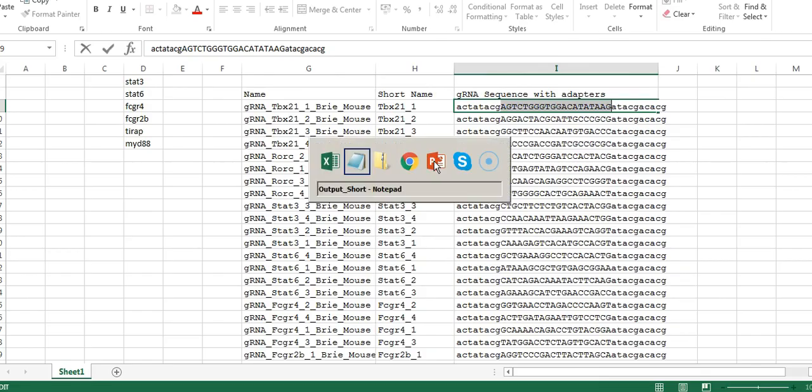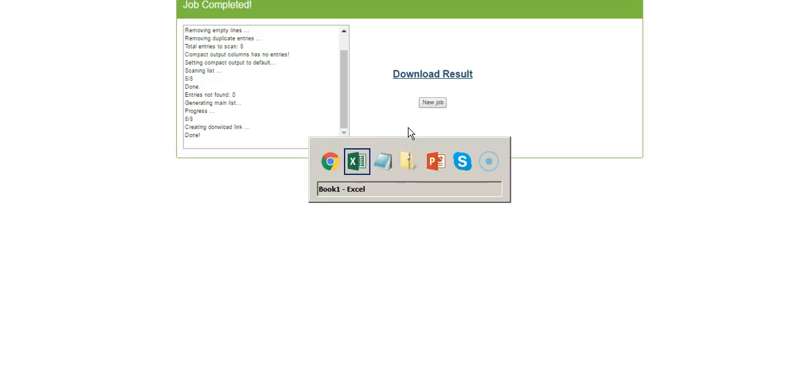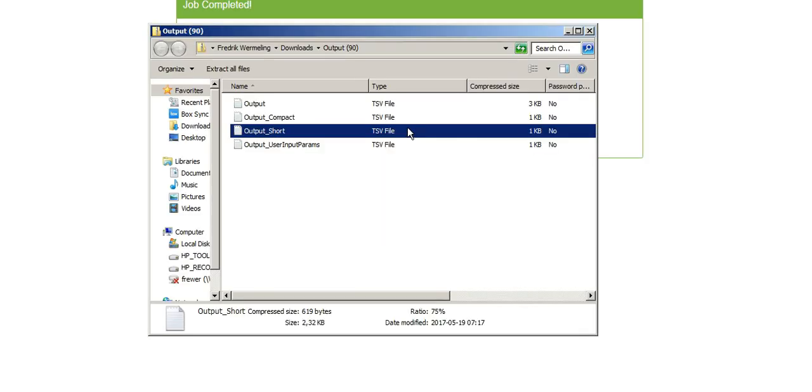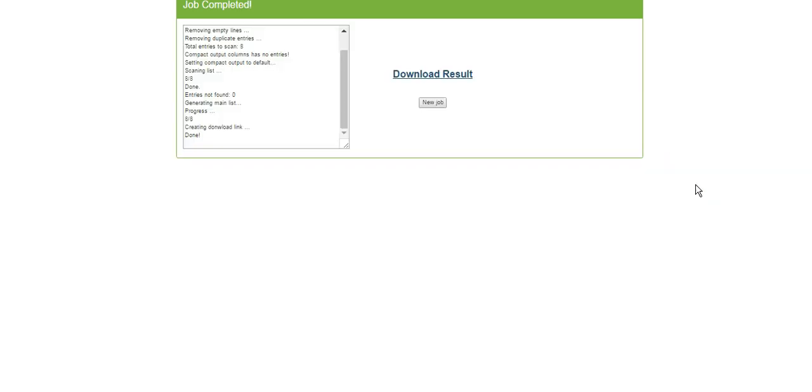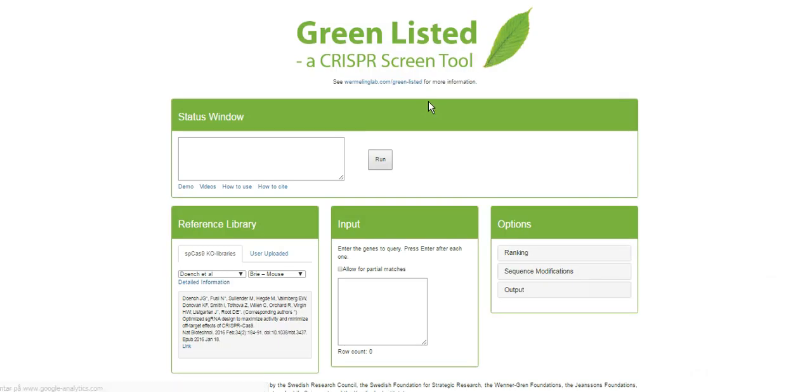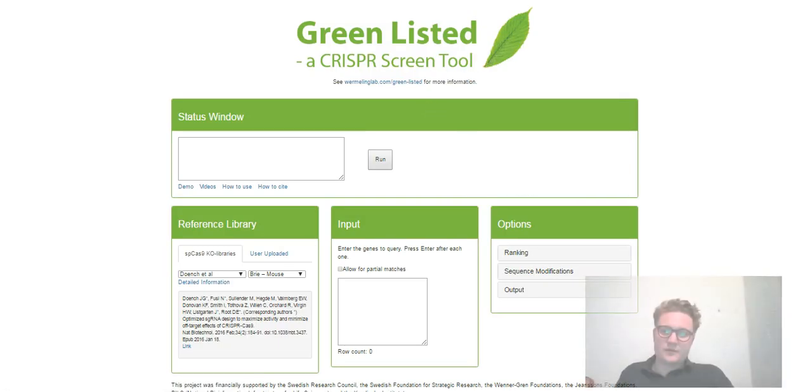And the way you could use this, then you could actually directly take this file, probably good to change the name of it, but you can take that file and just send it to a company that will synthesize these as an oligo pool. And then you can of course clone it into a vector and start your experiment.